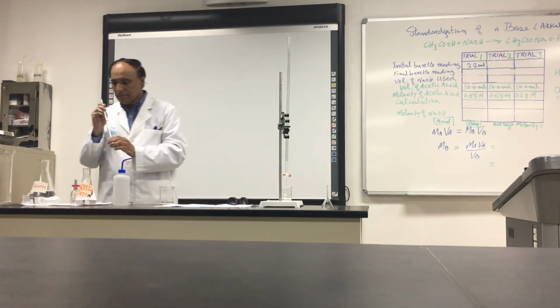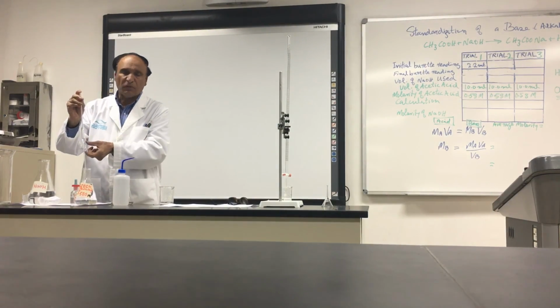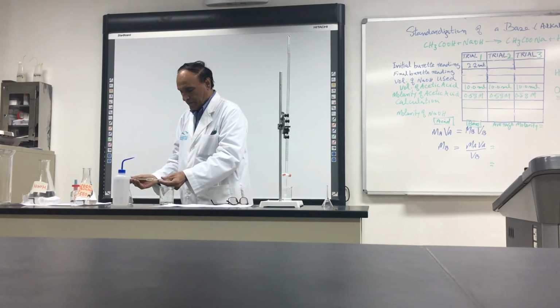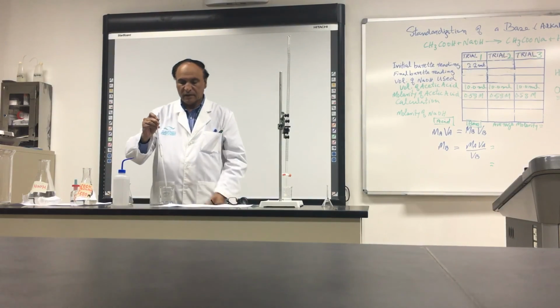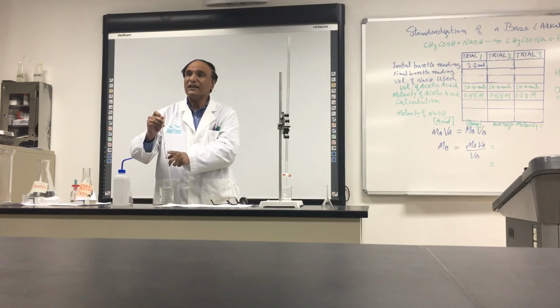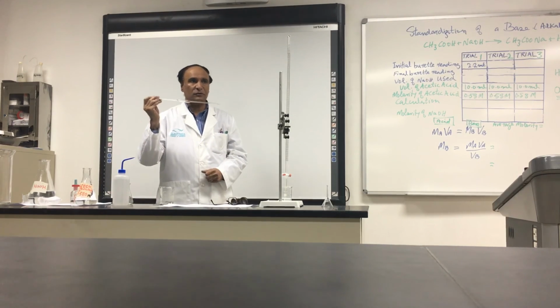So go there, take this one, take some quantity, close it and wash it. When you wash it, now it is washed with the acid, vinegar, khal. Is that right? So this is ready to use.